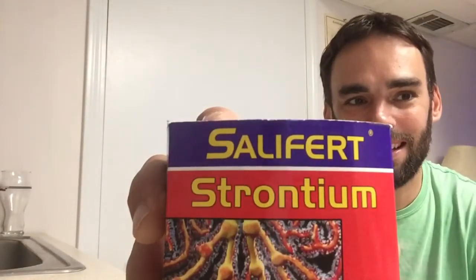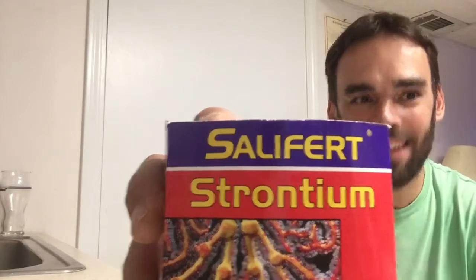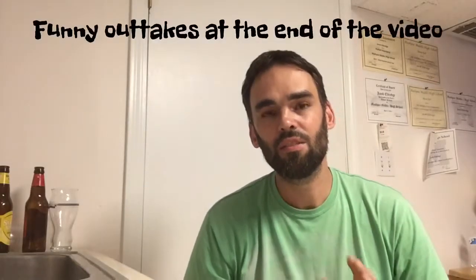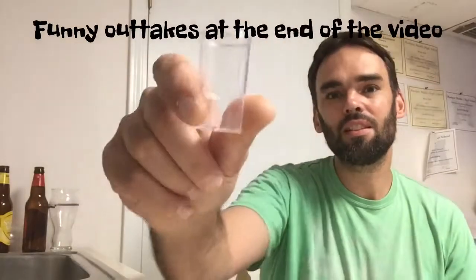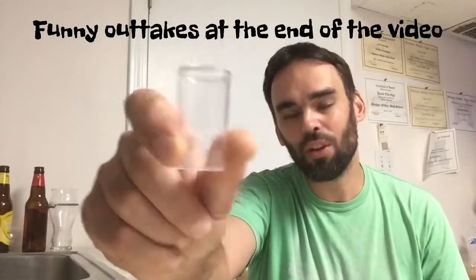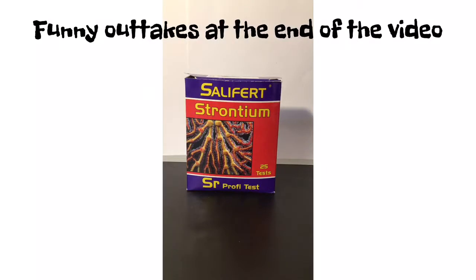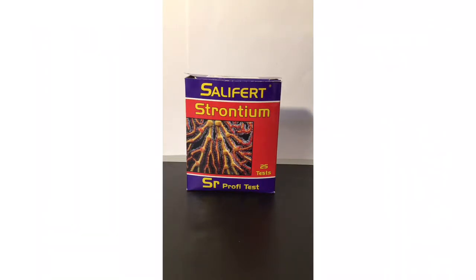Welcome back everybody. On today's video I'm going to show you how to use the Salifert strontium test kit. Just keep in mind this goes for any test kit — before you start testing for strontium, clean out your test vial thoroughly. It'll improve the accuracy of your test.